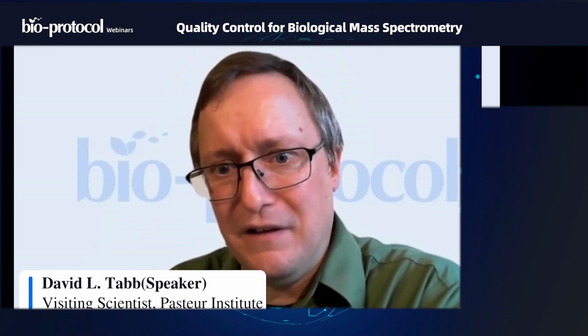Missingness is a real challenge because if you're trying to do something simple like a t-test, I don't know how well many implementations of t-test work if you say that 3 of these 5 values are NA, and on the other side I have 1 NA, not applicable.